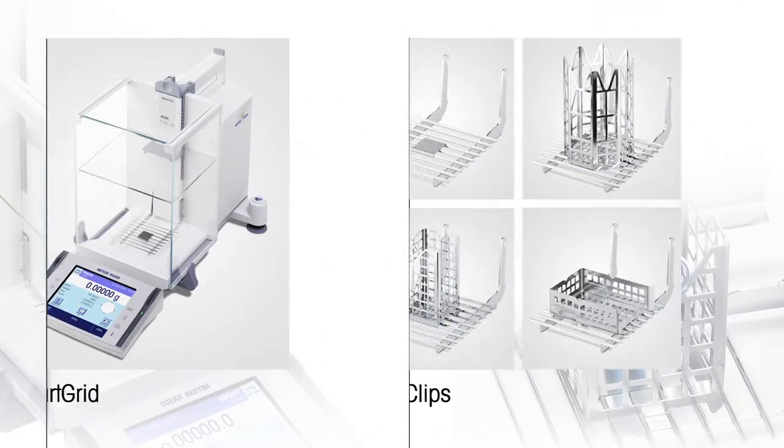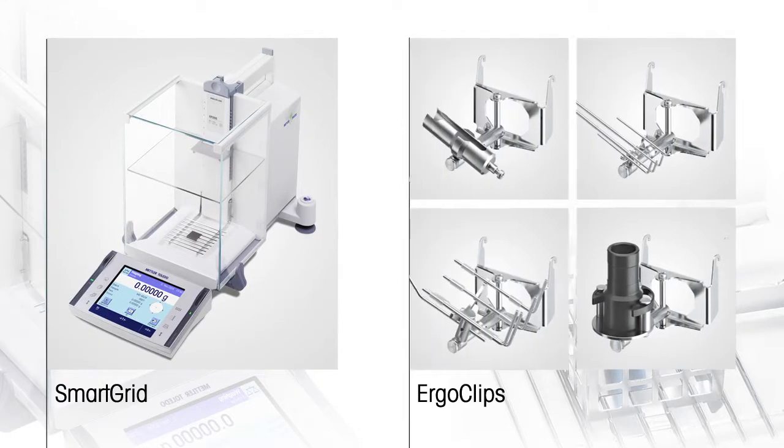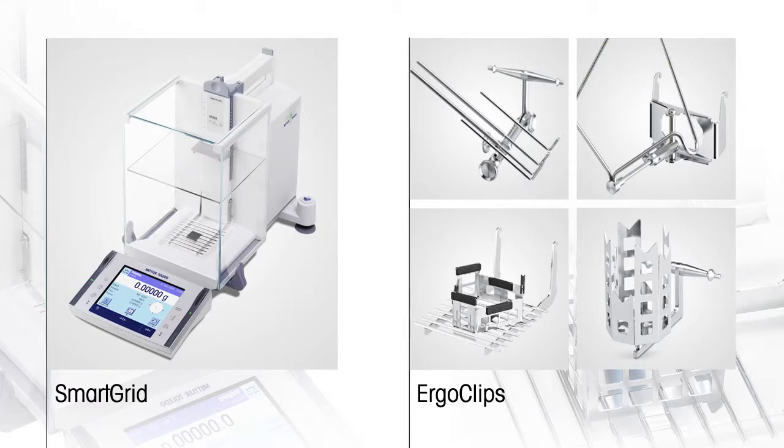Exploring these features a bit more closely, Mettler Toledo is pleased to showcase its innovative smart grid weigh pan and abundant line of ErgoClips.